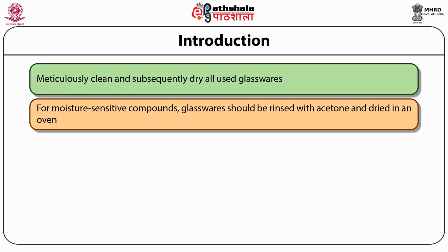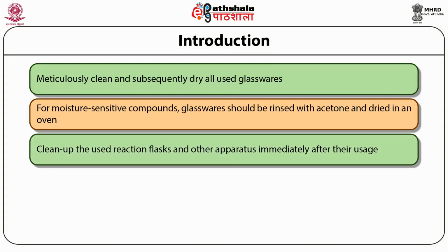It is indeed advisable to clean up the used reaction flasks and other apparatus immediately after their use so as to avoid a tedious cleansing process later on.